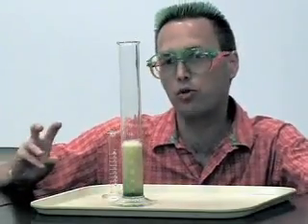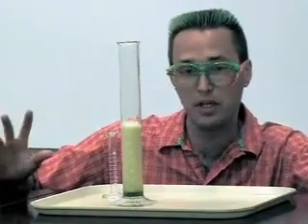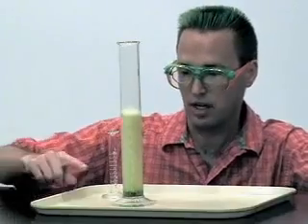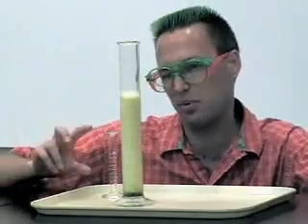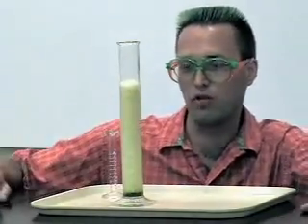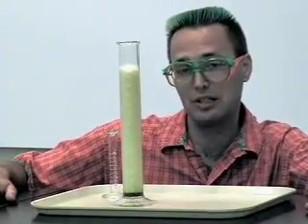Now this is 3% hydrogen peroxide. What you could buy at the store if you wanted to clean out a cut or something like that. Be careful with hydrogen peroxide because it gives off oxygen gas. So you can see here it goes. It's still bubbling off. Oxygen gas is coming out in a little foam. And I put a little bit of soap in there, dish soap, and that's going to make this cool little foam. And it's still going. So pretty cool. And we just may have to put this on stop time.